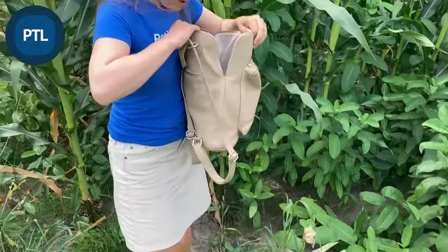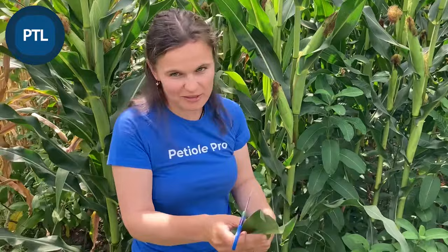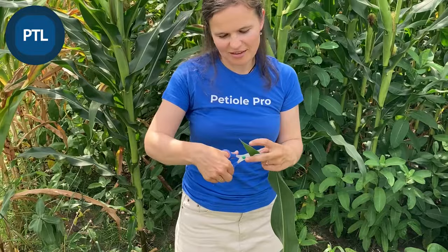I also need scissors, because scissors are important if you have long leaves. One of the ways to handle them is to cut them into smaller pieces and then use PTL for them. In this case we have very long leaves, so I will just cut them into shorter pieces.